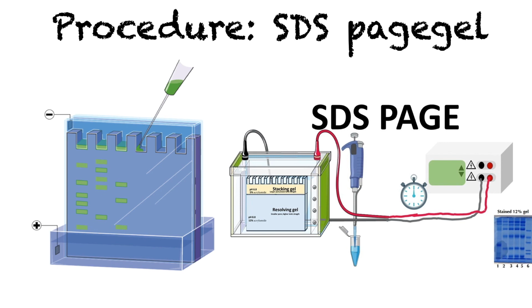That's all. Pretty much everything is similar for SDS-PAGE gel and agarose gel electrophoresis. The only difference is the gel type. Agarose gel has agarose and SDS has polyacrylamide, and SDS is generally used to separate proteins, and agarose gel is used to separate nucleic acids, DNA or RNA.